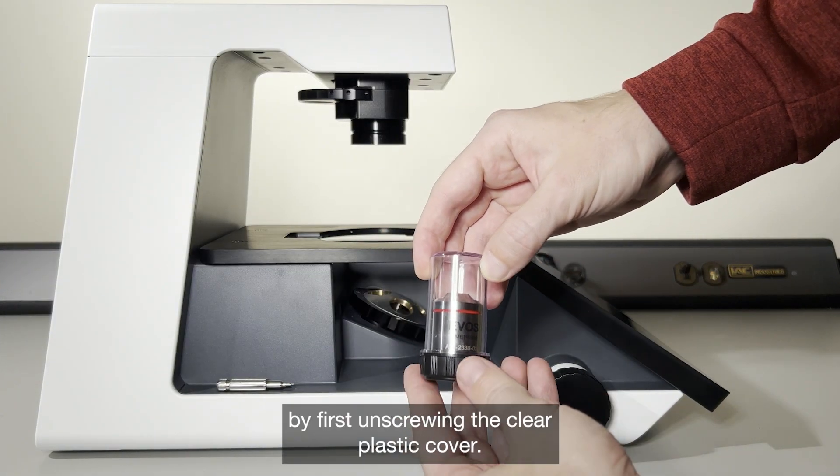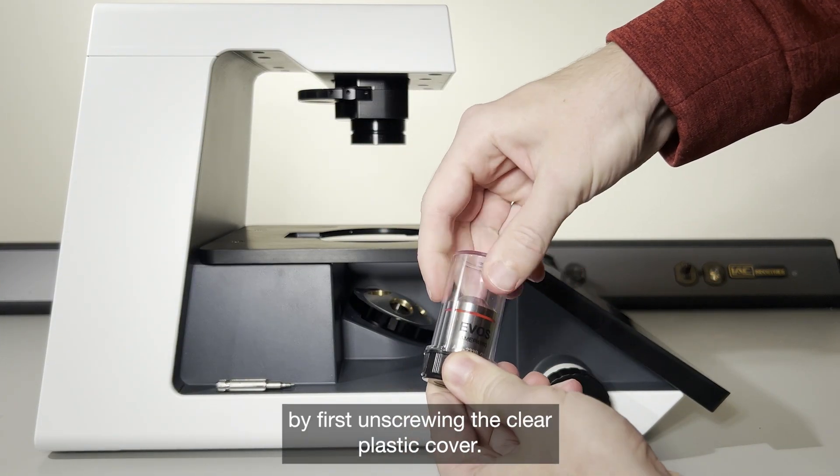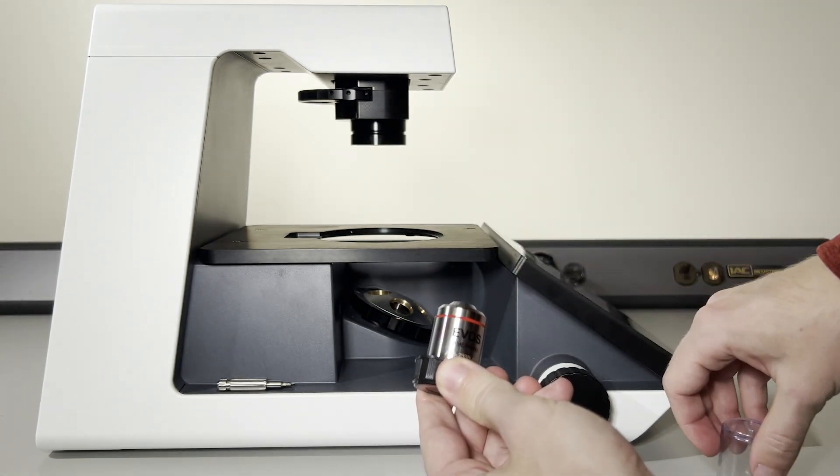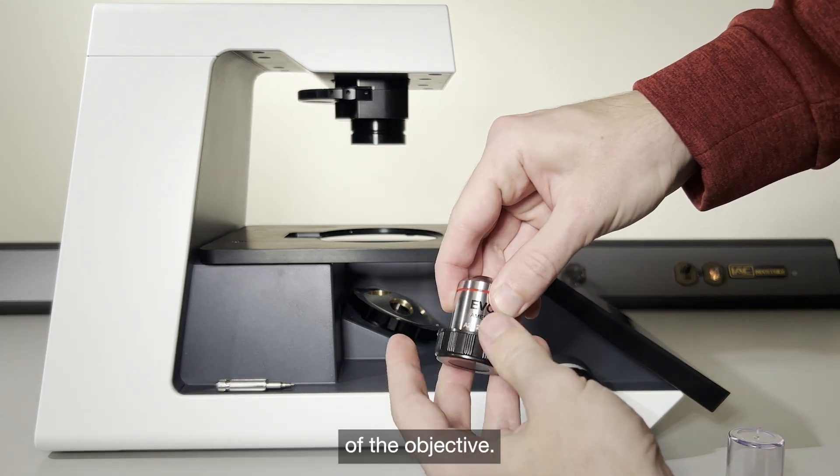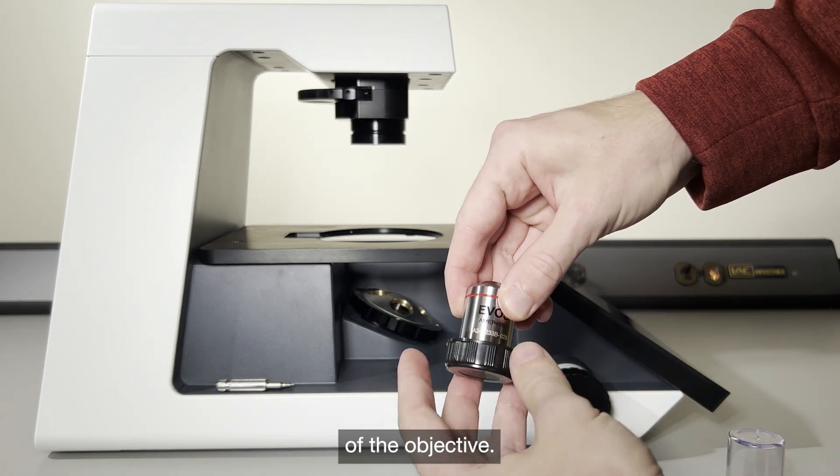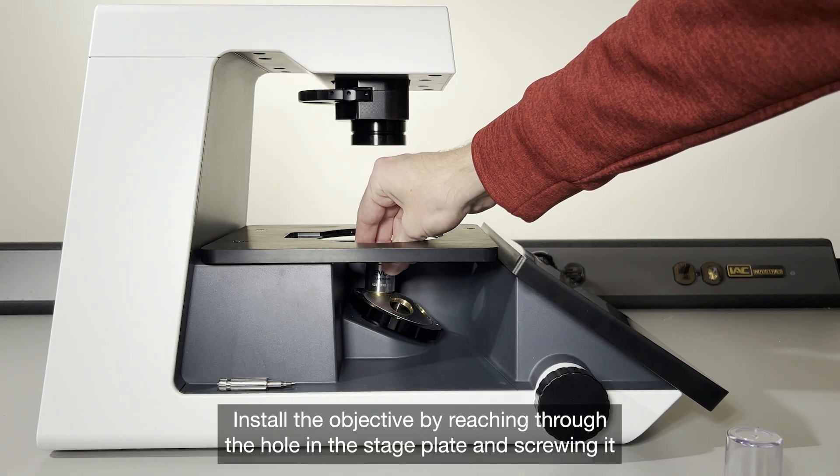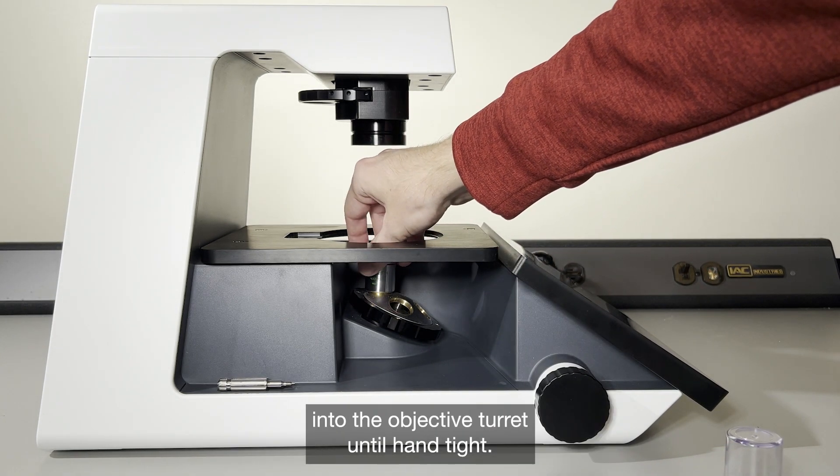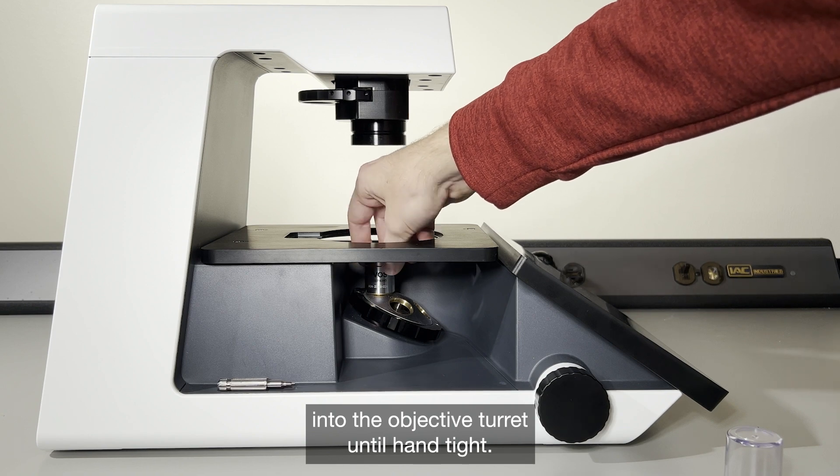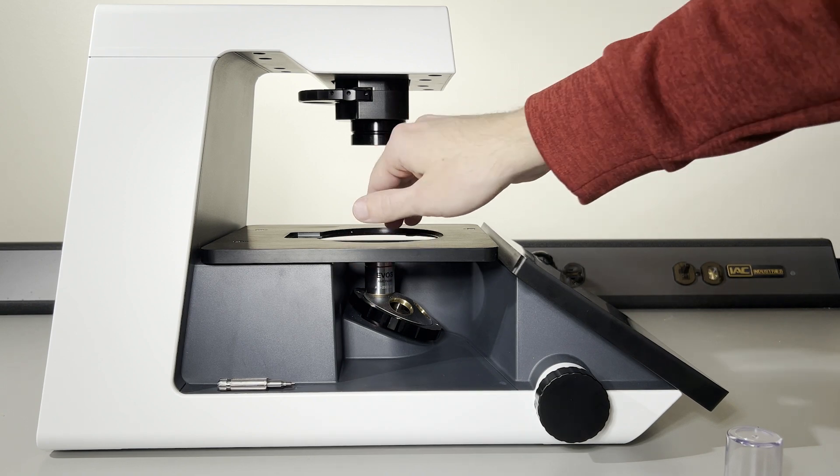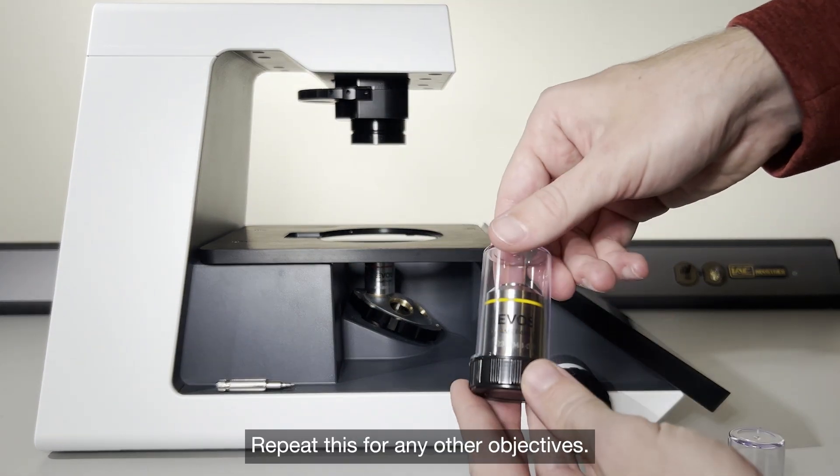Remove an objective from its case by first unscrewing the clear plastic cover, then remove the cap from the bottom of the objective. Install the objective by reaching through the hole in the stage plate and screwing it into the objective turret until hand tight. Repeat this for any other objectives.